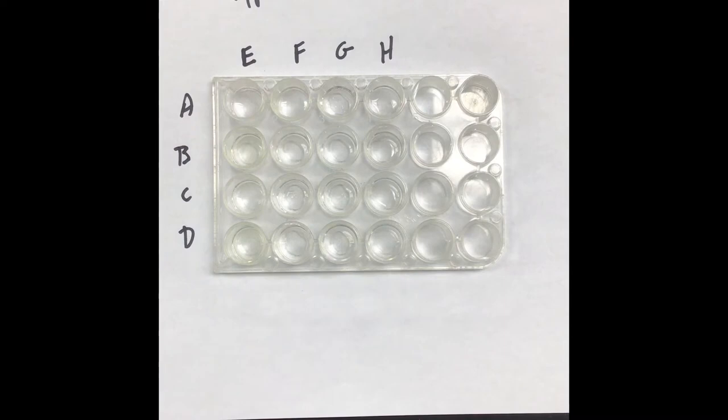Remember that the acids have phenolphthalein added to them, and so when we add base to it, it should turn pink. So I'm going to start with A, and I'm going to go straight across here, adding 10 drops each time. So 1, 2, 9, 10. 10. 10. Okay, so those are 10 drops added in each of those for row A.